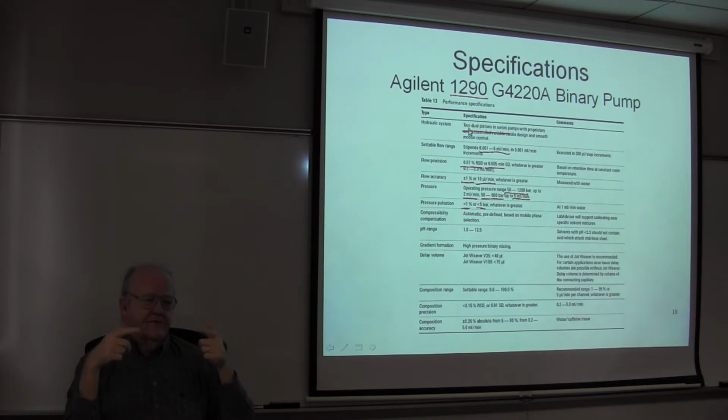And so if you're trying to make a gradient, you're going to get a nonlinear gradient if one fluid compresses more than the other.